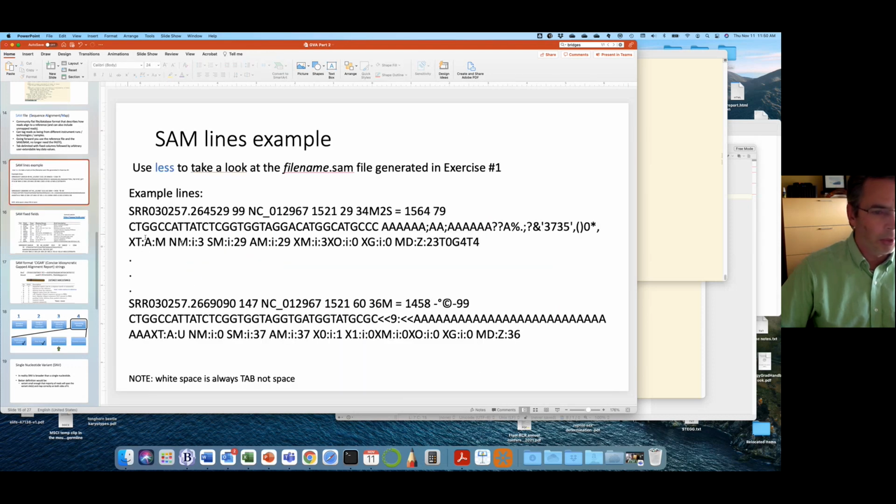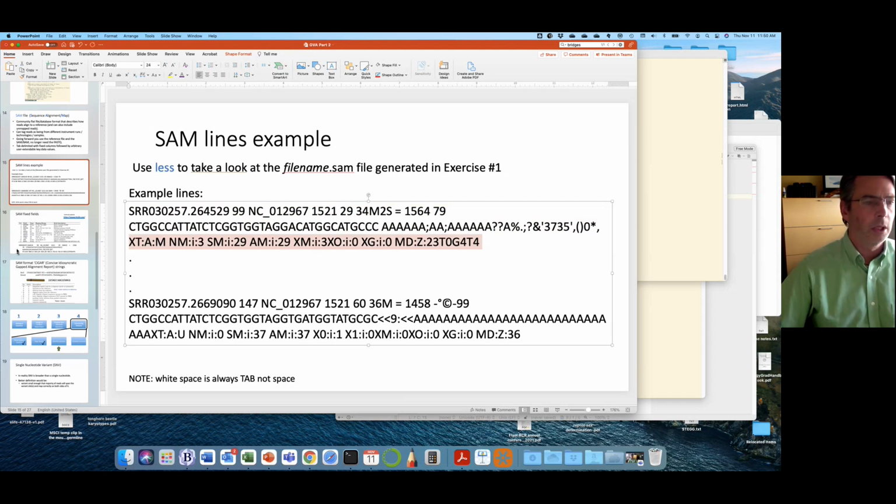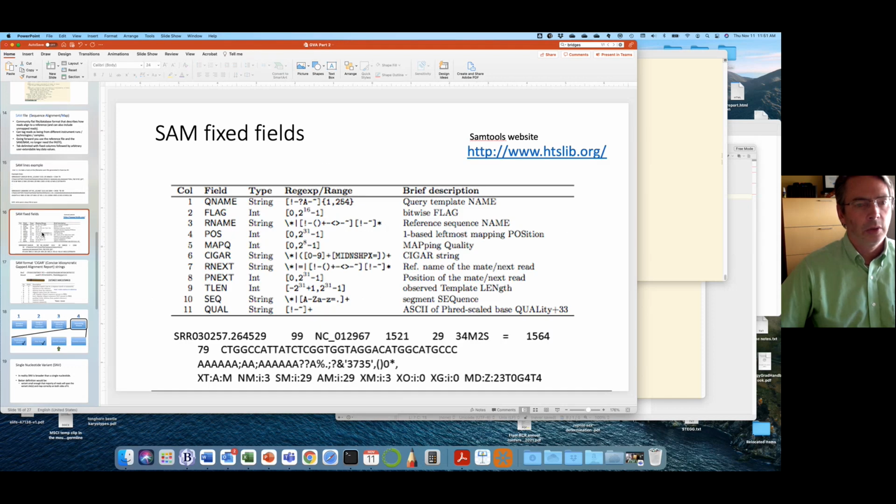Actually, I don't remember off the top of my head this notation. This is probably the CIGAR notation, which I'll tell you about in a second, okay? So essentially, the file format for SAM is, like I said, standardized, and it's not often, well, maybe not ever, that you're going to actually go try to read the SAM file, right?